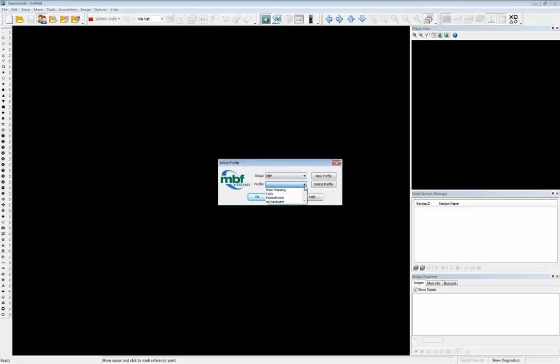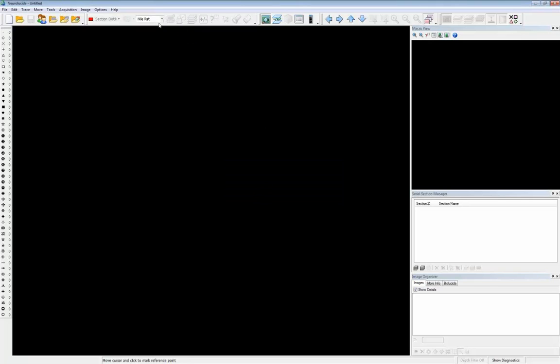So you can have multiple profiles that represent either different hardware configurations or even different tasks that you're going to be doing. You can also set this up according to individual lab members as well, if you would prefer. And so for the brain mapping, you can see that we have no icons that relate to tracing neurons because that's not what we're doing today.